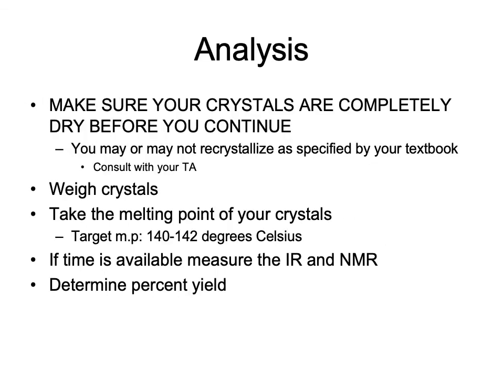So for the analysis of the work, we want to know how much material we obtain, and by doing IR and NMR we are going to make sure that we produced aspirin.